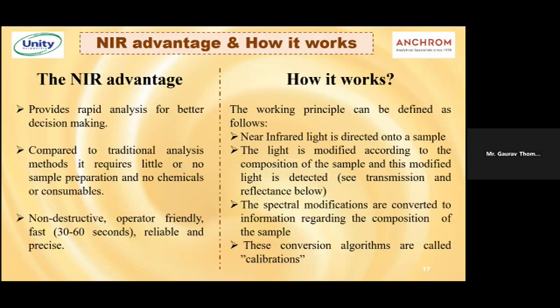Once you homogenize it, it simply needs to be kept in the sample cup and then analyzed. When you are crushing it, it doesn't require any chemical. The NIR also doesn't require any chemicals for its functioning or for the analysis of the sample.